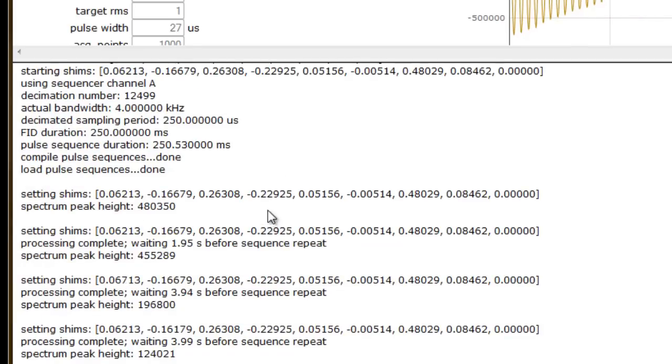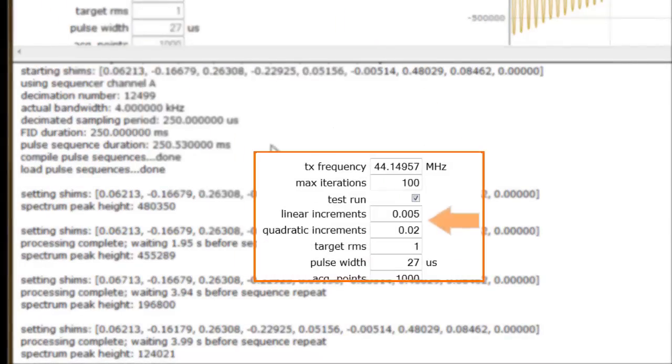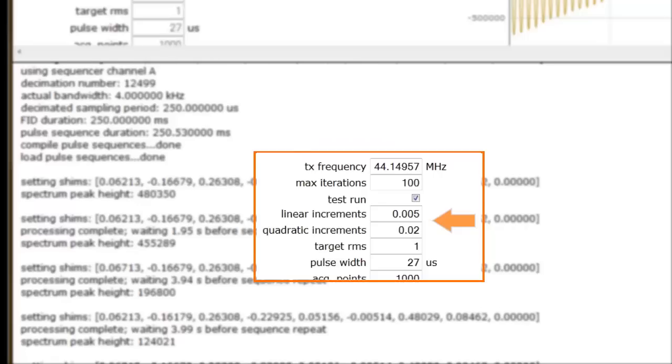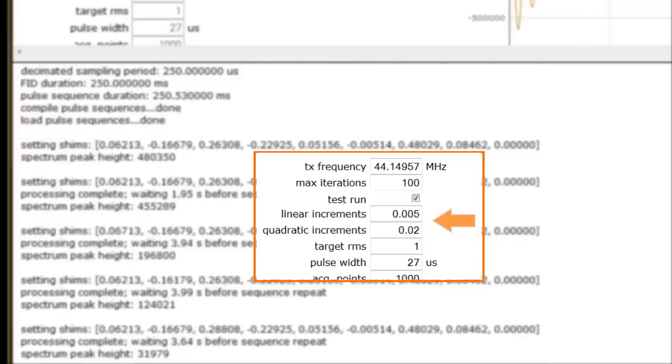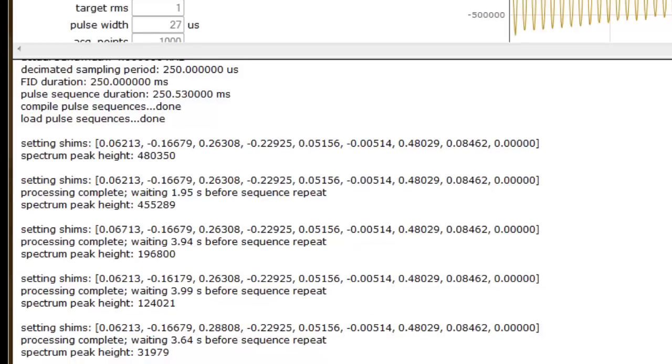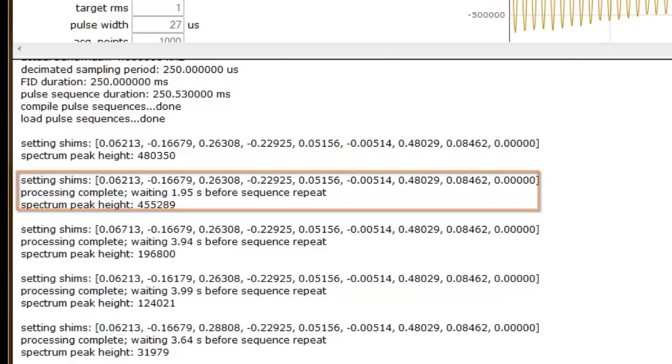These shim settings will be adjusted by the AutoSIM script by some fractional amount of the increment step size as we indicated in the linear and quadratic increment parameter fields above. The sign and size of the step taken is within our initial parameter value. How the step size and sign are adjusted is determined by this simplex algorithm after evaluation of the spectrum peak height. This information is repeated after every pulse executed during shimming.